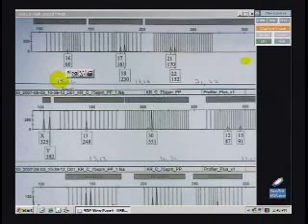It's a different 3130 or 3100, so you can't. Yeah, and that's what I was told. I didn't think it would be such a huge difference between samples. I would normally expect it to be very close to saturated, because if I collected 100, I would expect things to be off scale and be having difficulty. So we thought, let's just throw in 75. That should be plenty. But these are pretty low. So do you think instruments would actually be that different, to the point where you would have an order of magnitude difference between hundreds and thousands? Yes, they are. Okay.